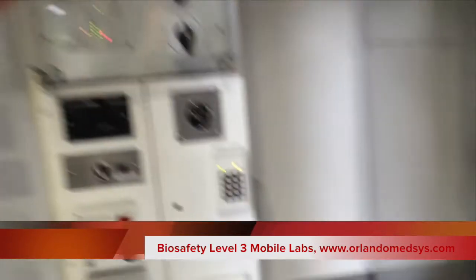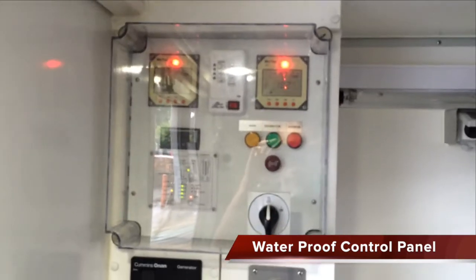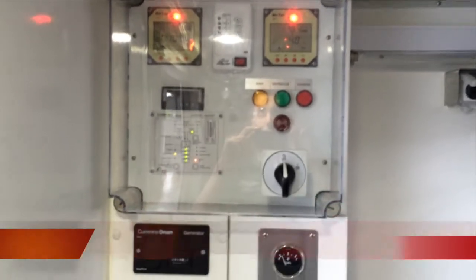Inside the lab you have a main control panel. The control panel has indicator lights for the solar batteries, indicator lights for the main power, the generator power, and the inverter power, to tell you what's powering the lab.